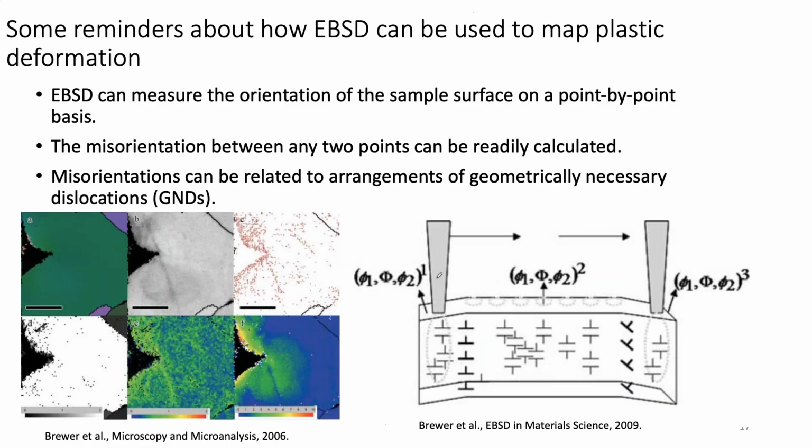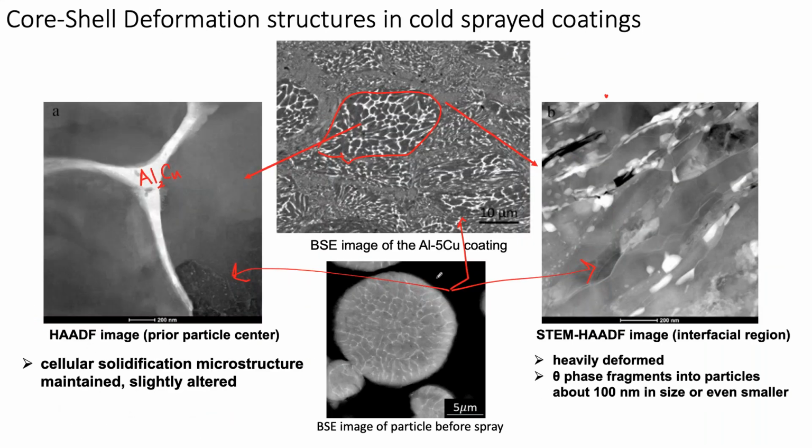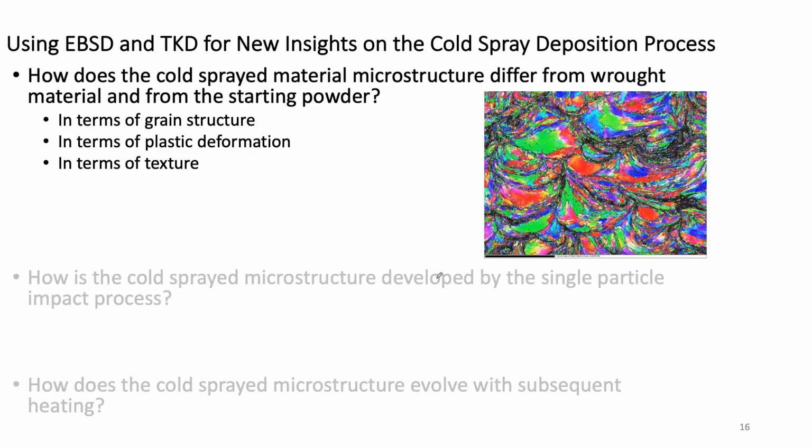So, in terms of cold spray itself, let's focus on one here. Jacob did a particularly fantastic job on this recently. These are actually all in metallographic mounts, and we follow standard metallographic procedure. One of the key things in EBSD is the finish. We find that finishing with vibratory polishing is really important, so doing a careful job of vibratory polishing is key. But these are all mechanical metallography based samples of the actual deposits.